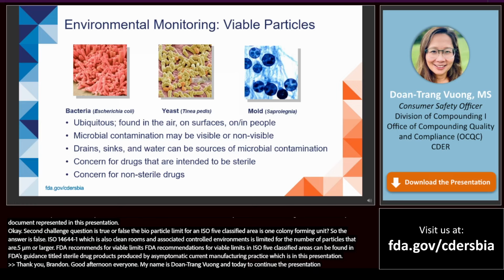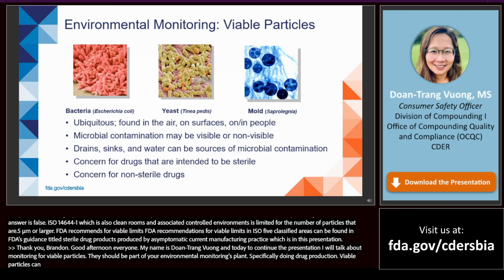Monitoring for viable particles should be part of your environmental monitoring sampling plan, specifically during drug production. Viable particles can be bacteria, yeast, or mold. Drains, sinks, and water can all be sources of microbial contamination in your clean room. It's a concern for both drugs that are intended to be sterile, as well as non-sterile drugs.